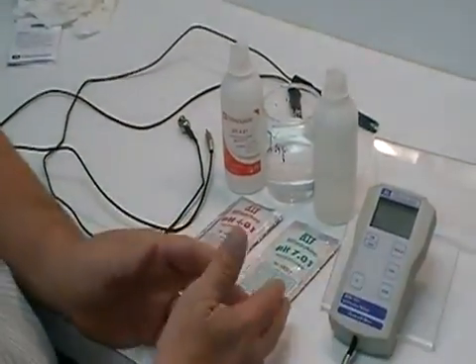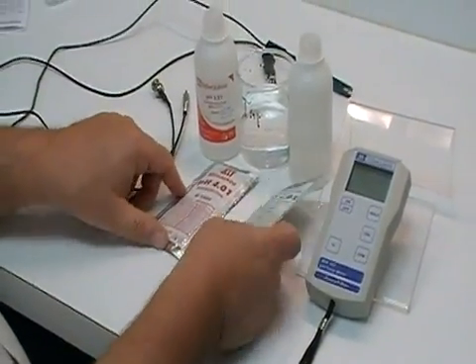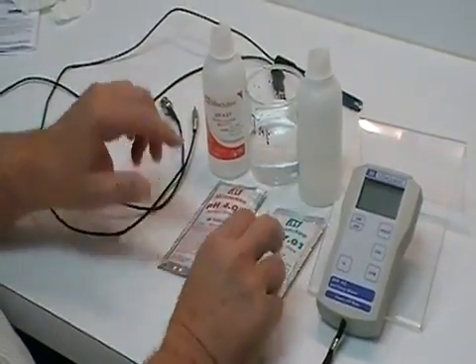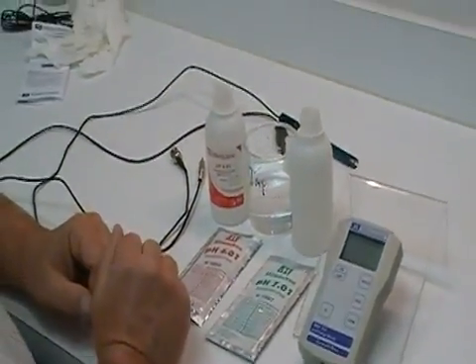When you get your instrument, you've got a battery — we've already put the battery in the unit. You get a 4 and a 7 calibration packet like this. For the sake of doing this demonstration, we're going to use the bottles because it's a little bit easier to handle.